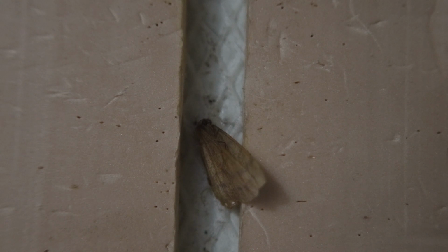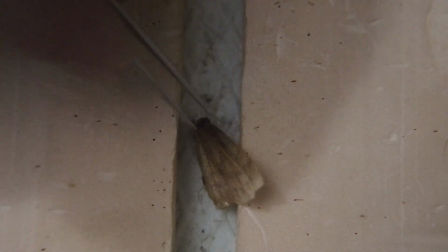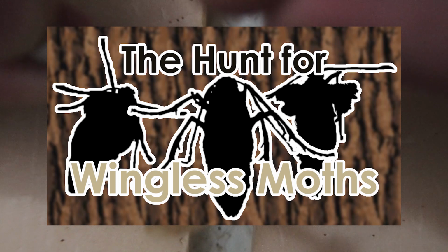Today I am going to be pinning a scarce umber moth, scientific name Agriopis aurantiaria. Now, this is a male moth because if you had seen my most recent video, which you should totally check out here, then you will know that the females of a scarce umber are basically wingless. So, as you can easily tell, this is a male.